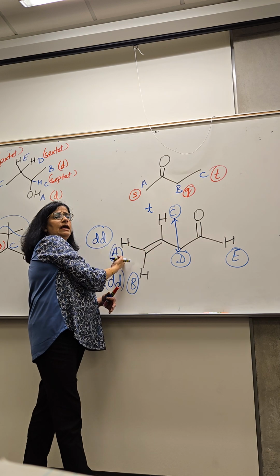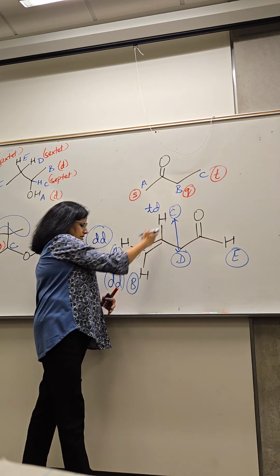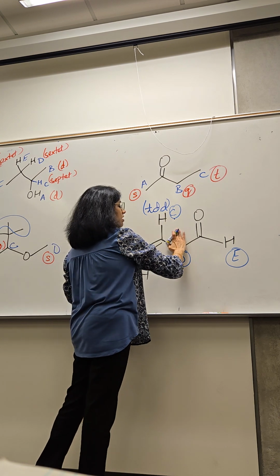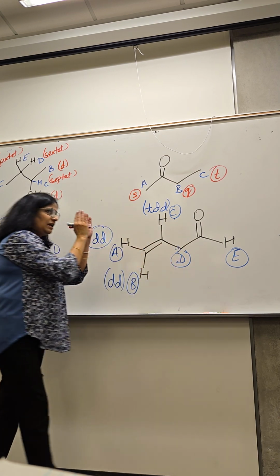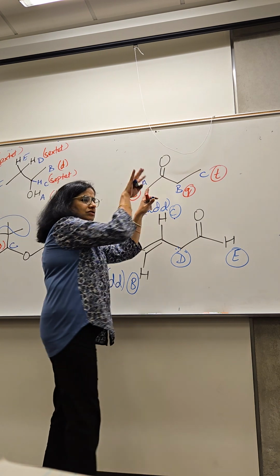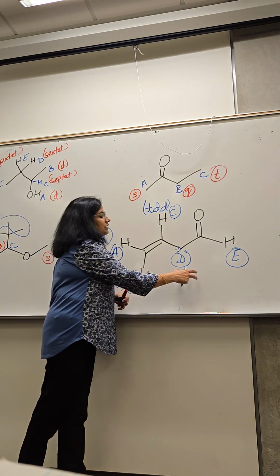What about CA? And what about CB? Probably going to see a very complex pattern over there in that part of the spectrum, which will look like a mess of signals because they're all kind of sitting on top of each other. Okay, let's get to D though.